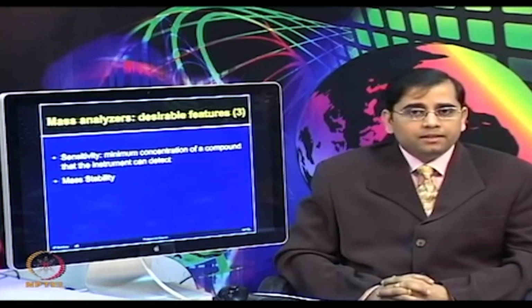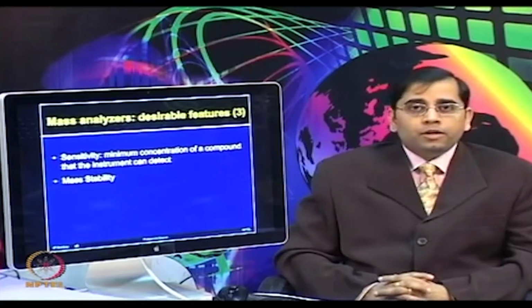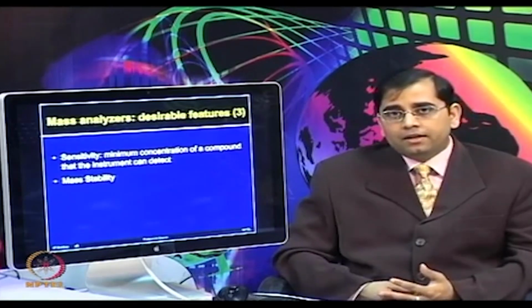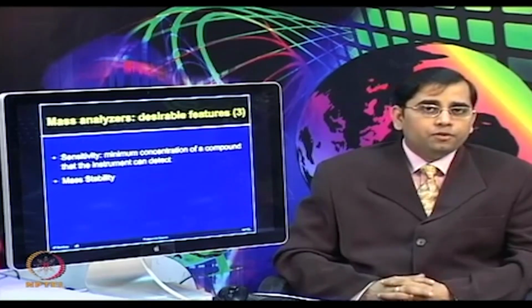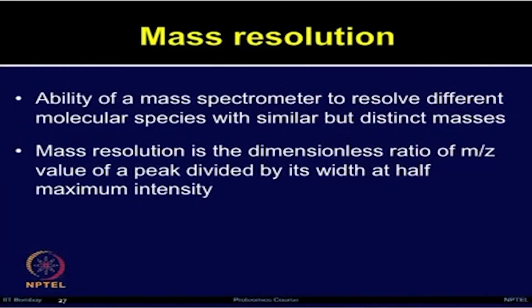Mass stability, how reproducible is the measured mass. So, while you are comparing various types of mass analyzers, one needs to look at all of these parameters and then only can one decide for what application they can select which type of mass analyzer. While we discussed various properties which are desirable for the mass analyzers, let us talk about mass resolution and mass accuracy in a little more detail.